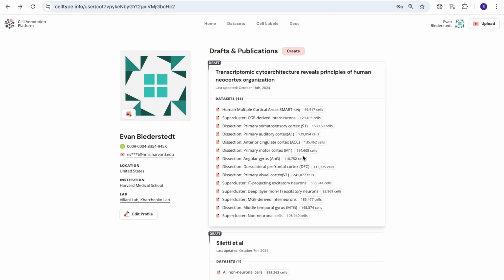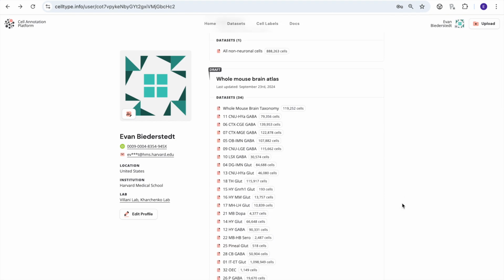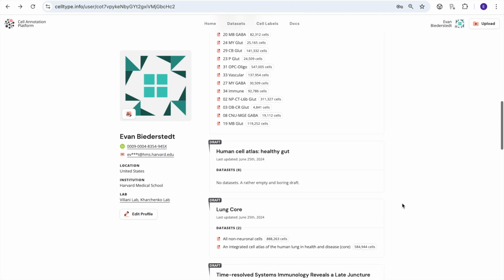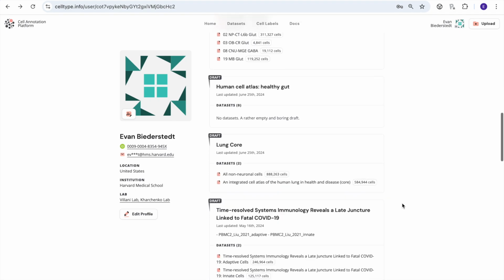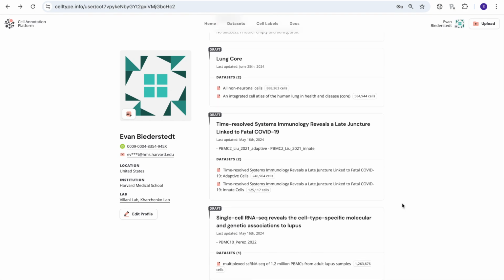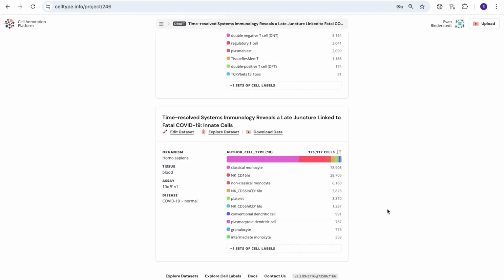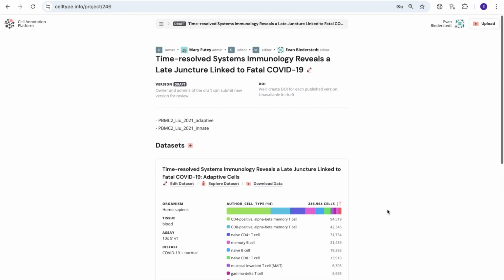And these are what I was describing earlier. These are only accessible to me. You could think of these collections of data sets as what we call workspaces. These are collections of data sets that only I have access to unless I invite collaborators to work on these data sets. And so if I look at, let's say, this, you'll see there's two data sets in this workspace, and there are others who have access to this.